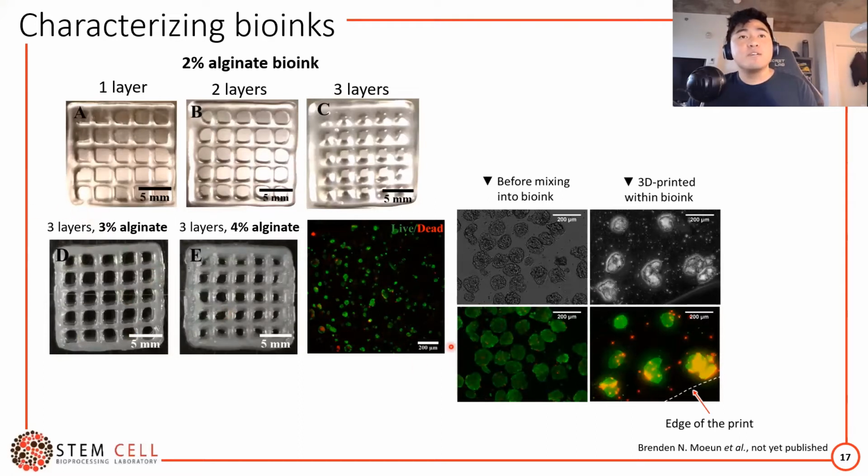And when you put cells in there, single cells, they seem to survive. So in addition to print quality or the actual geometry of your prints, what is also important in bioprinting is whether your cells survive, so that the cross-linking doesn't affect the viability, and also other things like the extrusion process. And again, if you're familiar with some of our work, we do a lot of work with pseudo-islets or islet-like clusters. These are cell aggregates, as islets are anyway. And in order to mimic this, we also 3D printed cell aggregates similar to the size of islet equivalents, and also achieved some pretty promising viability.